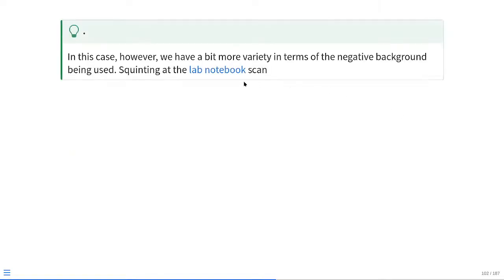So, in terms of negative background, this is the gating set we already were anticipating to be a little bit more complicated, especially having gone through last walkthrough where we had to do all these adjustments for the scatter gate based on if it was a cord blood, a PBMC specimen, or an activated versus control condition. So right off the bat, we know negative background is likely to be important. If you're working with your own data, this is really easy to do because you already know what you're doing. If you're deep diving FlowRepository or ImmPort, you're really at the mercy of the original person who has shared the data in terms of being able to correctly match the backgrounds for each other.